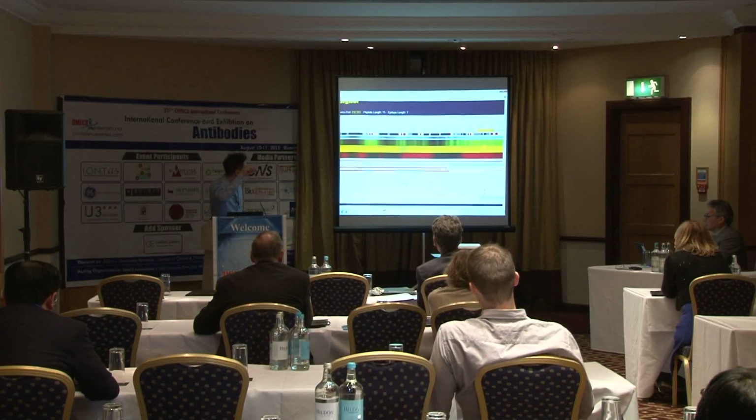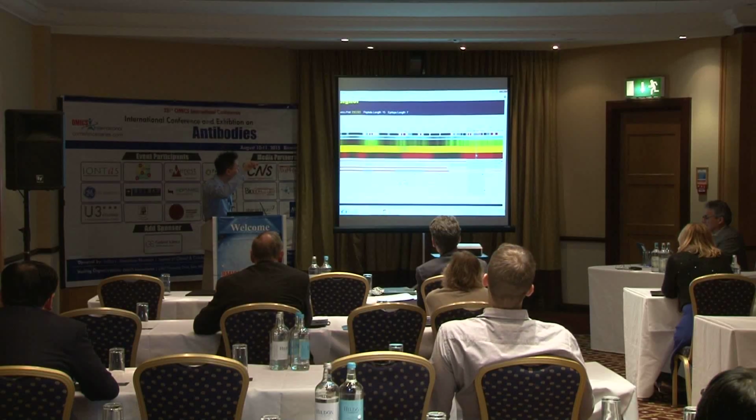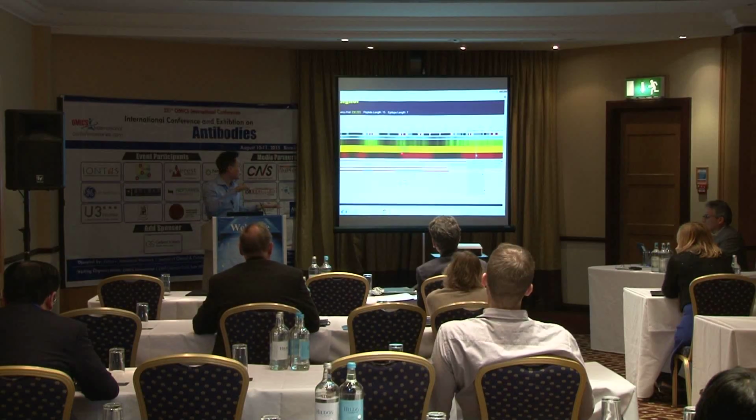So in combination, it aligns all the information, so you can look at one vertical alignment and see all the parameters that help you decide. If you had to do this by hand from different tools, it would easily take days.